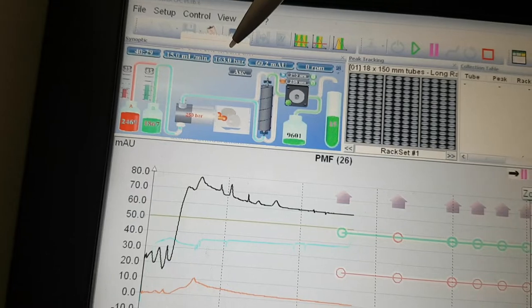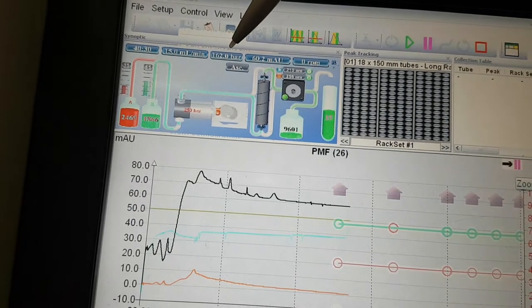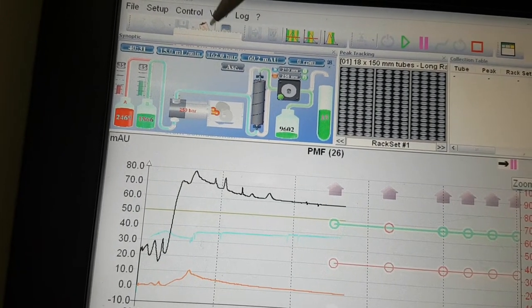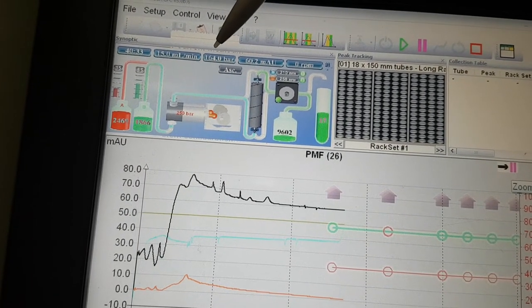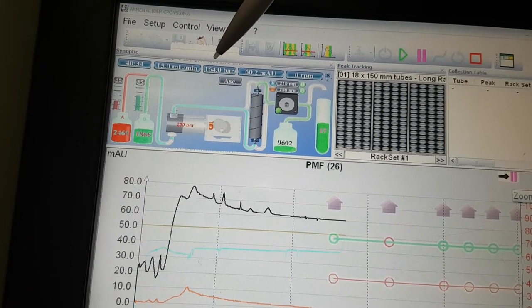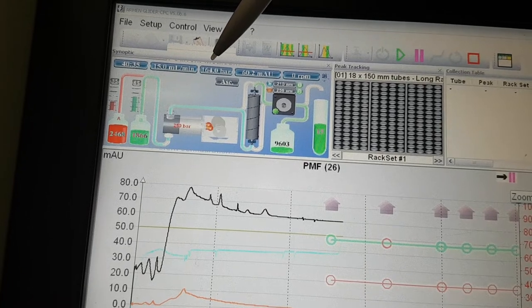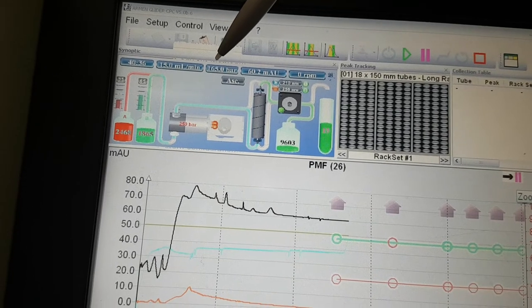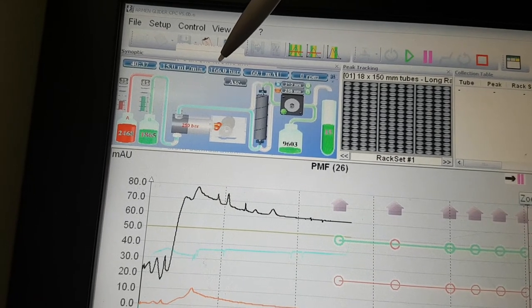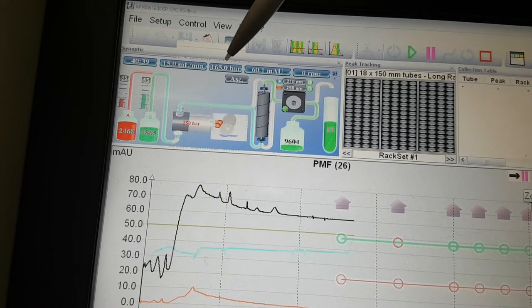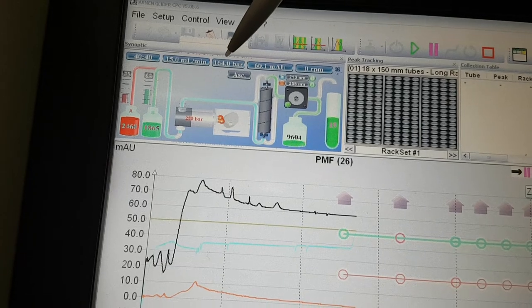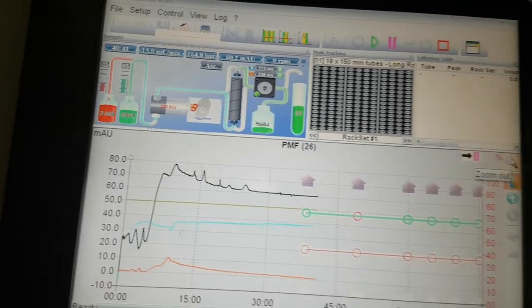When you are using only methanol, it will not use a lot of pressure. But once you use water, the pressure will increase. You see here.